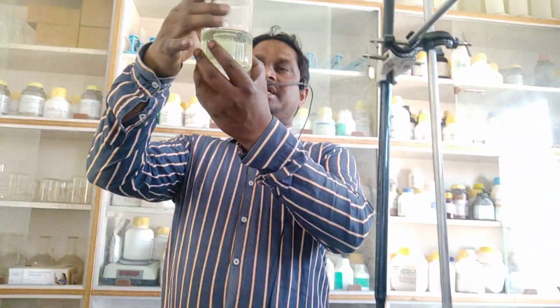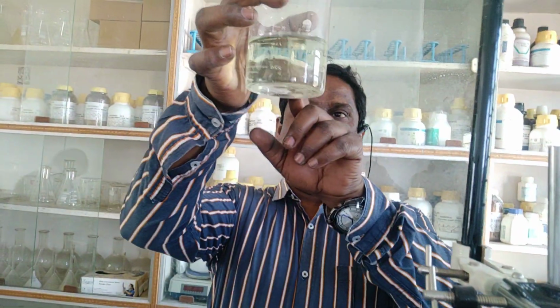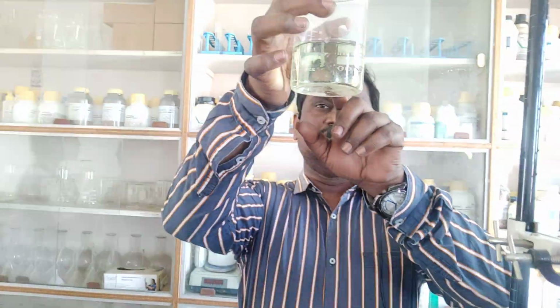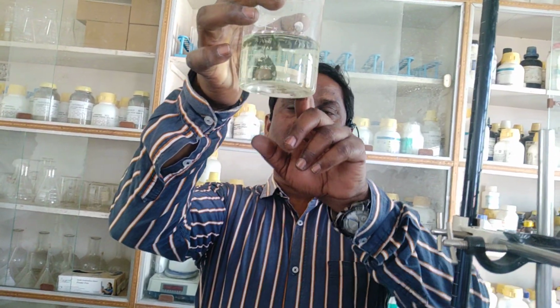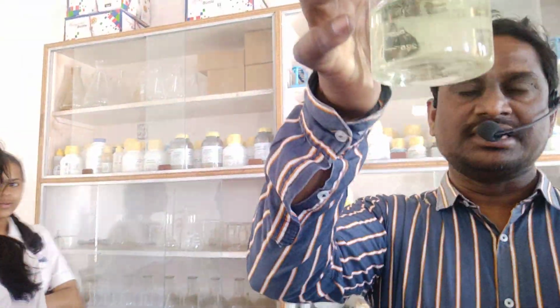This ferrous ammonium sulfate we also call Mohr's salt. Clear? So now you can observe here. Already we have prepared this FAS solution. See, light green is there. Are you seeing, children? This is ferrous ammonium sulfate, also called Mohr's salt. The formula is (NH4)2Fe(SO4)2.6H2O. So this is the formula. Okay?